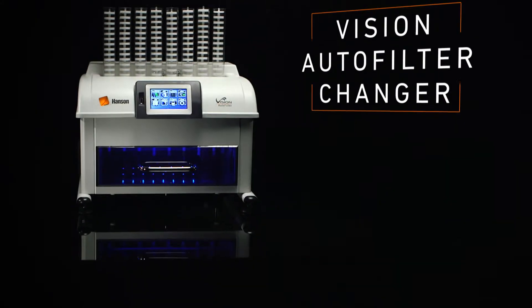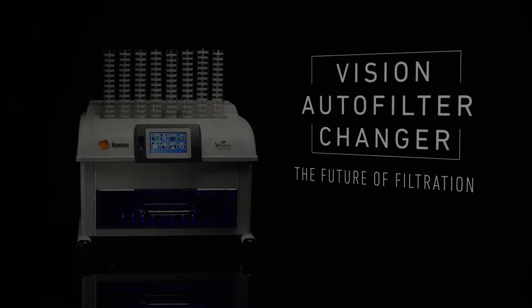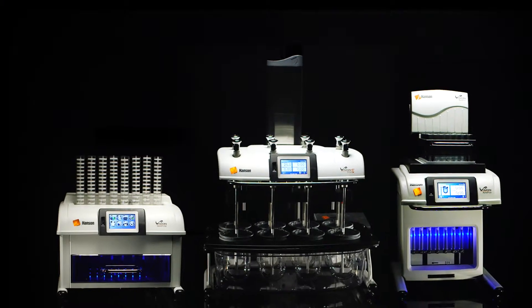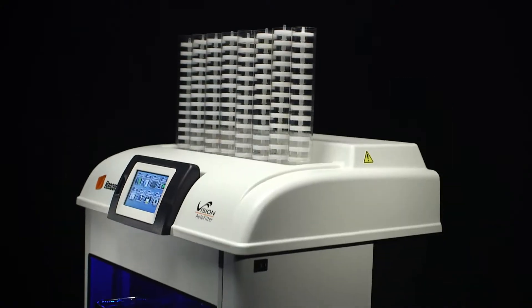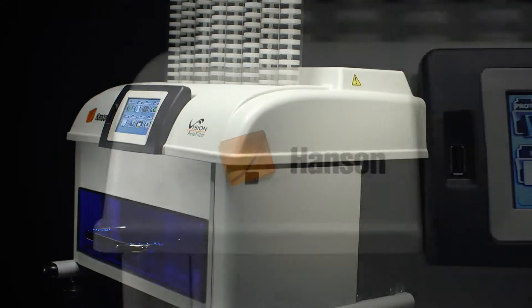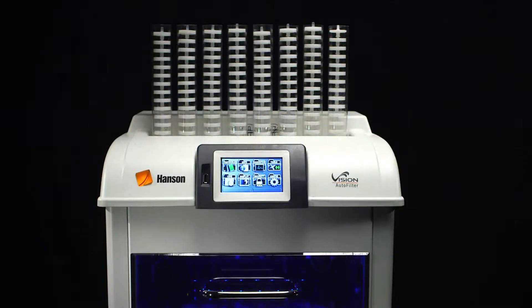The Vision Auto Filter Changer — the future of filtration. Designed as a seamless addition to Hanson's Vision line of premium dissolution test instruments, the Vision Auto Filter Changer brings a new approach to automated filtration. It puts the power in your hands.